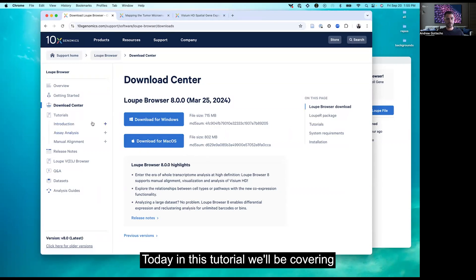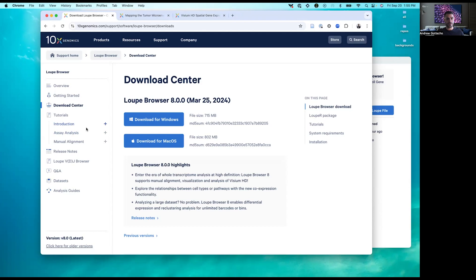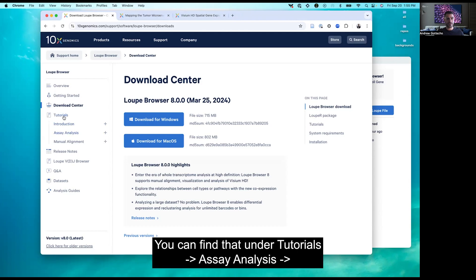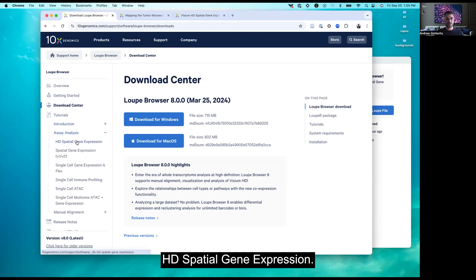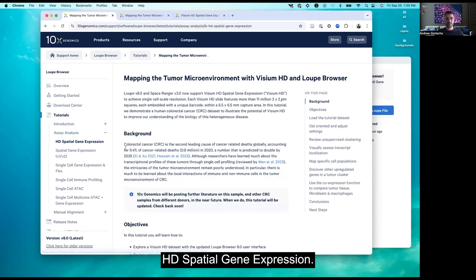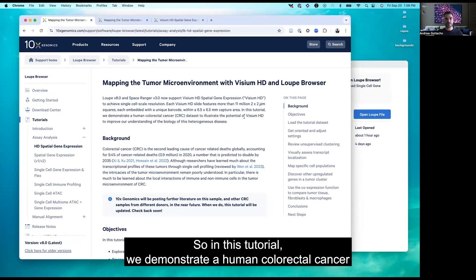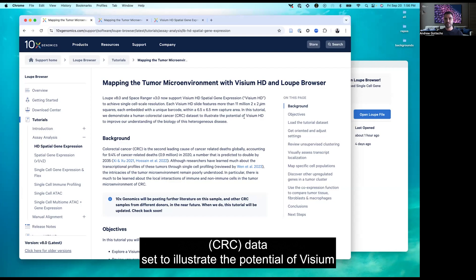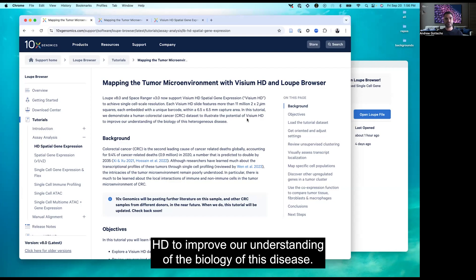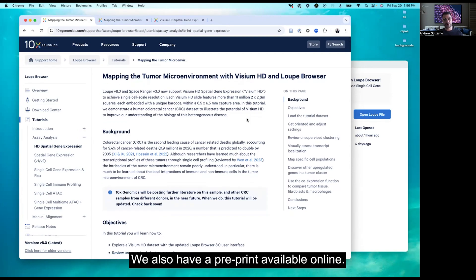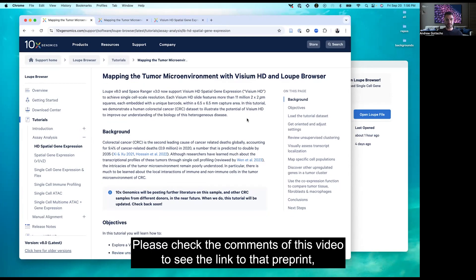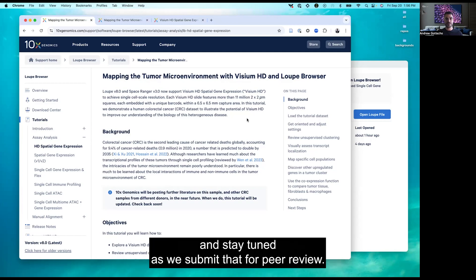Today in this tutorial we'll be covering the HD tutorial, which you can find under Tutorials, Assay Analysis, HD Spatial Gene Expression. We demonstrate a human colorectal cancer dataset to illustrate the potential of Visium HD to improve our understanding of the biology of this disease. We also have a preprint available online — please check the comments of this video for the link, and stay tuned as we submit it for peer review.